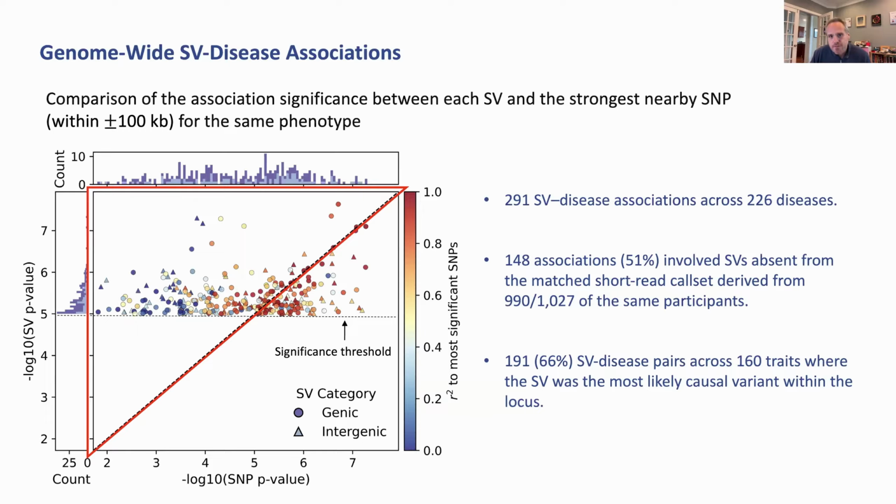This is a really important finding in my mind, whereas most of the time GWAS has been focusing on SNPs, and again, that's been driven by the technology, starting with microarrays, and more recently short-read sequencing. Most of the time, it's actually the structural variants that are more significant. We just didn't have the right technology. We didn't have HiFi technology until right now. But most of the time, it's the structural variants that are more significant.